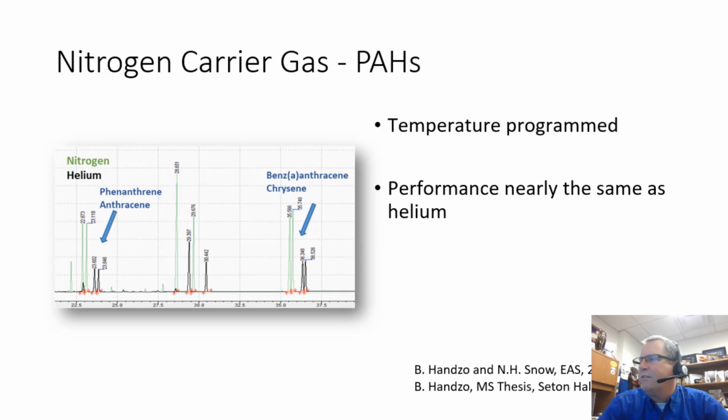I did write an article in LCGC magazine. This is actually Brittany's work. And one of the things you see in Brittany's work here is that the peaks pretty much look the same. You will see a retention time shift if you change carrier gases.